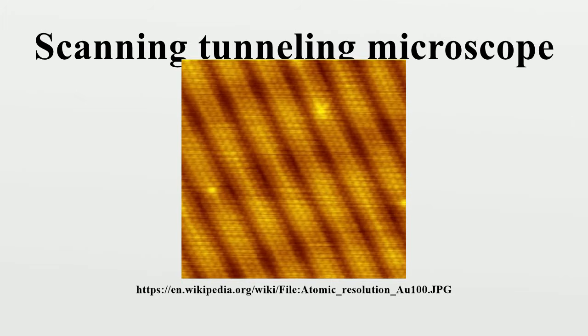tunneling matrix element. John Bardeen solved this problem in his study of the metal-insulator-metal junction. He found that if he solved Schrödinger's equation for each side of the junction separately to obtain the wave functions psi and chi for each electrode, he could obtain the tunnel matrix M from the overlap of these two wave functions. This can be applied to STM by making the electrodes the tip and sample, assigning psi and chi as sample and tip wave functions, respectively, and evaluating M at some surface S between the metal electrodes, where Z equals 0 at the sample surface and Z equals W at the tip surface.